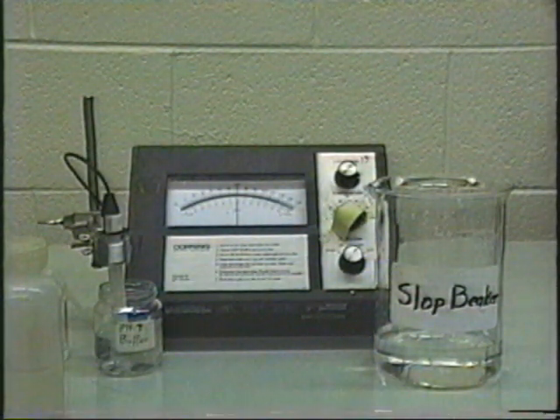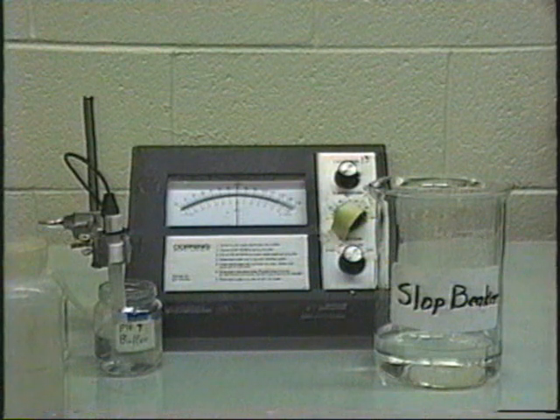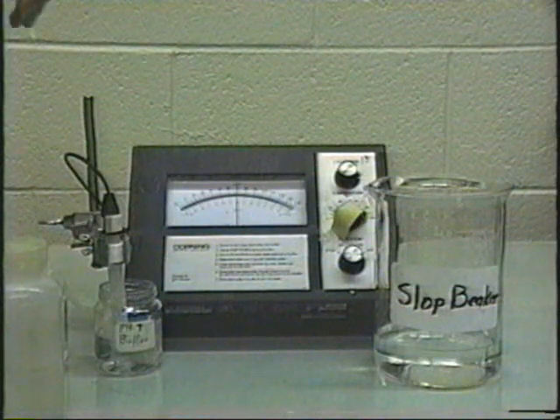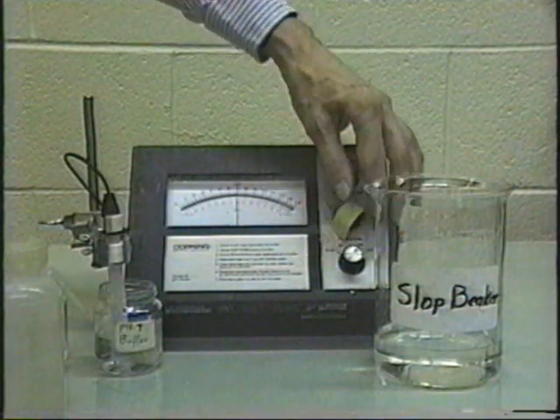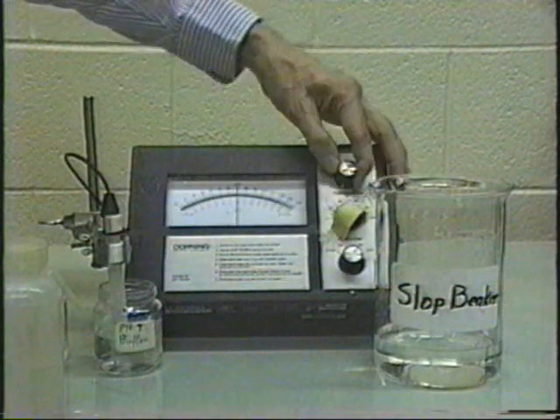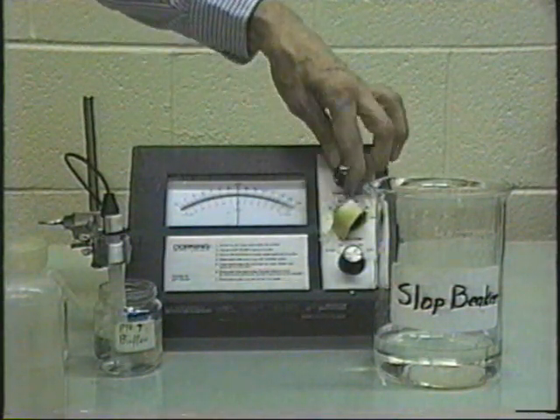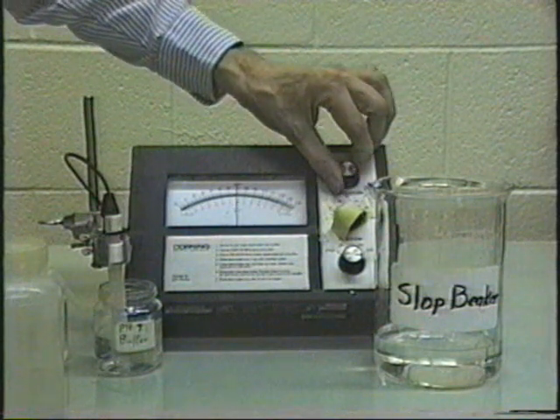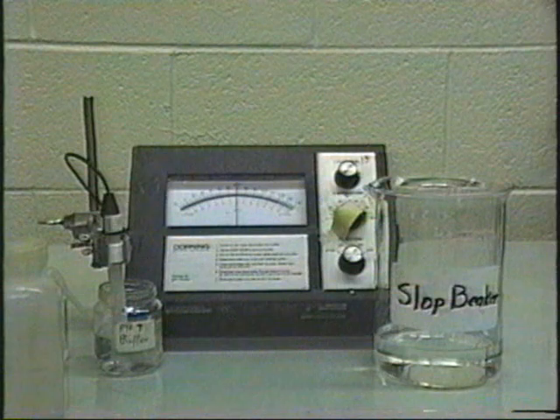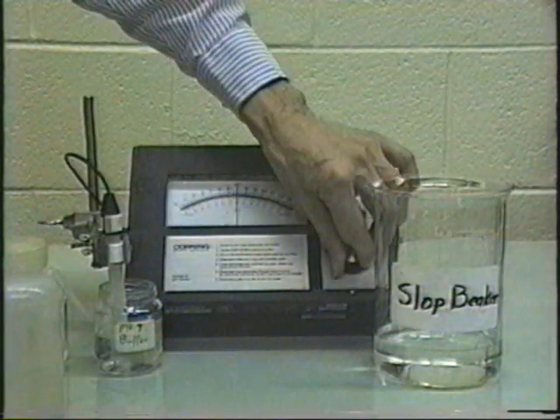Well, let's make our measurements now. To do that, first we'll calibrate the pH meter. We have the pH meter sitting in the pH 7 buffer here. And to calibrate this then, what we'll do is turn the meter to the pH reading, and with the calibration knob, we will adjust the needle until it is exactly on 7.00. Now the meter is calibrated, and we will make our measurement.